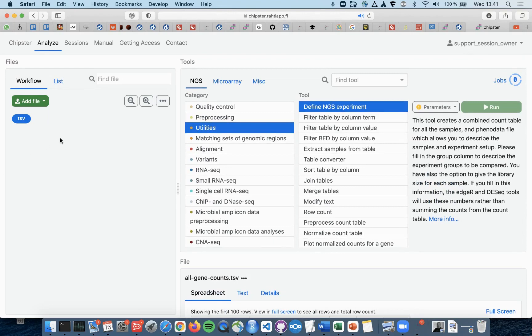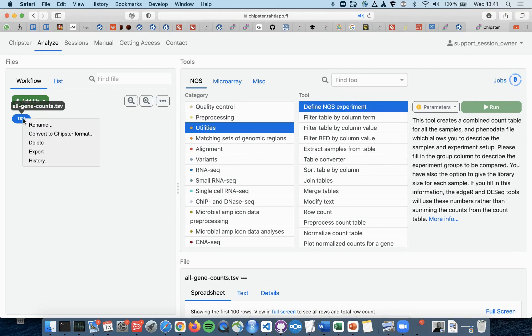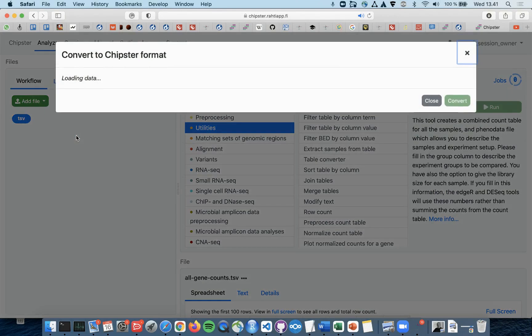Instead, you now want to just import your file to Chipster and then right-click it. Now you can choose Convert to Chipster format.